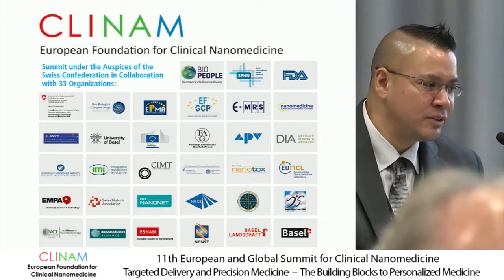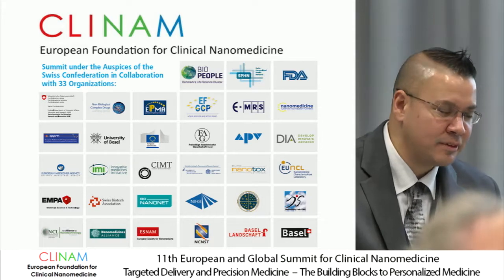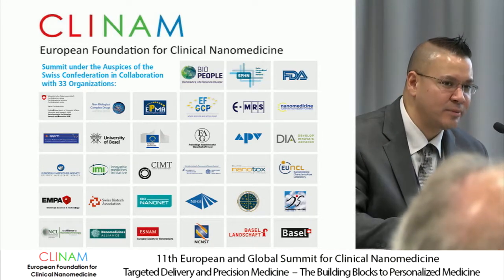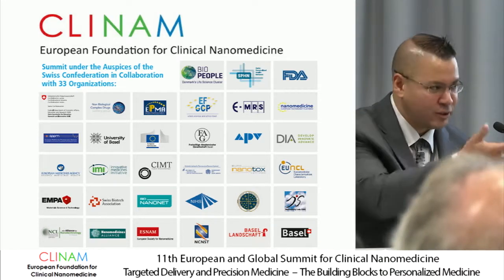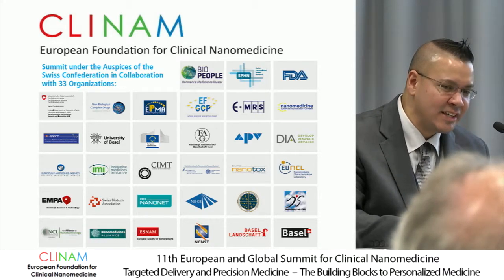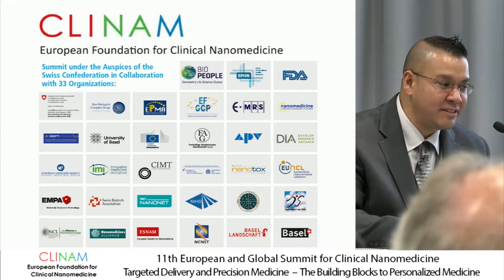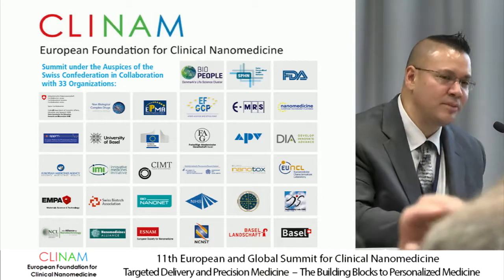In that case, you would look to something else as a CQA. Maybe that's drug release, drug kinetics, for example. Now, I didn't show that, obviously, because I try to focus only on the sizing aspect, but we look at many different parameters beyond size, and there are many, as shown by the presentations today, to look at. But just trying to answer your question, it goes beyond that, and you really have to link that to some biological outcome when it comes down to it. It may be that sizing may not be the CQA in that case, right? In which then you move to something else.